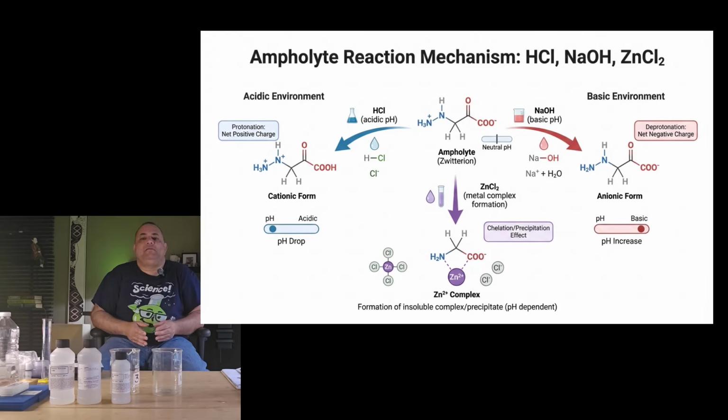In this lab, I'm going to demonstrate the amphoteric compound zinc hydroxide. It can react with acids and with bases. So depending on whether the solution is acidic or basic, the zinc flips behavior.